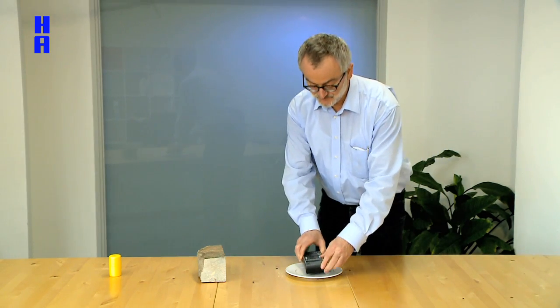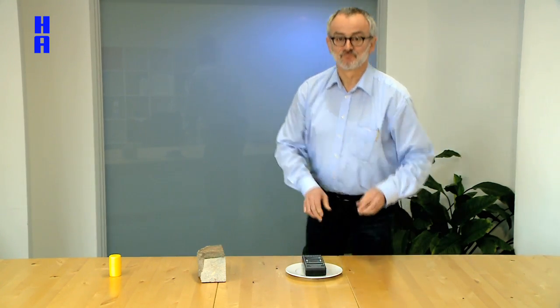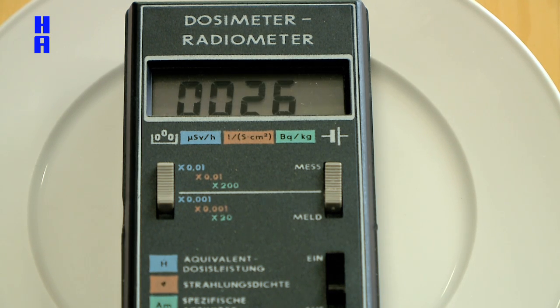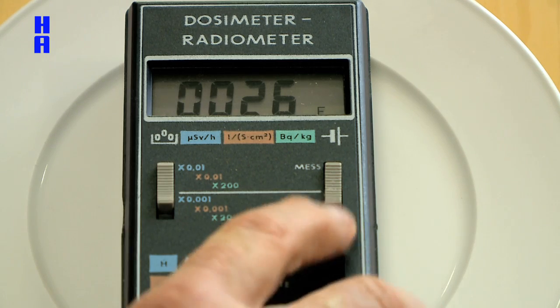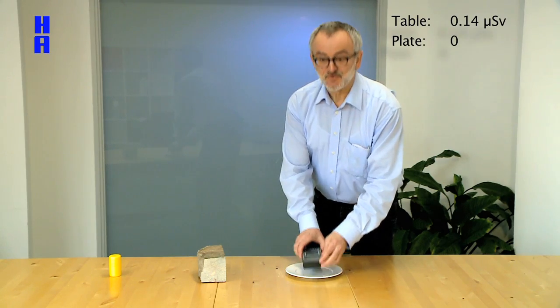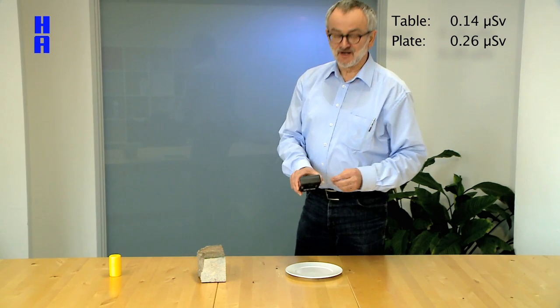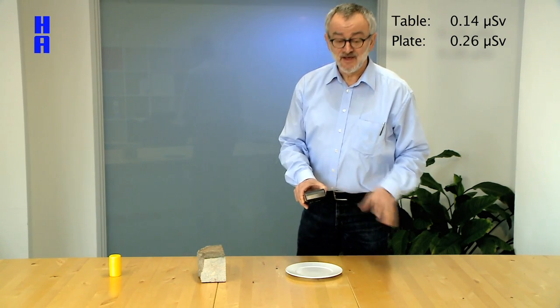Now let's continue using an ordinary plate. The value here is 0.26. Surprisingly enough, it's almost twice as high as for the table.